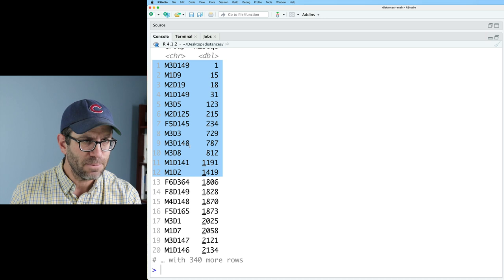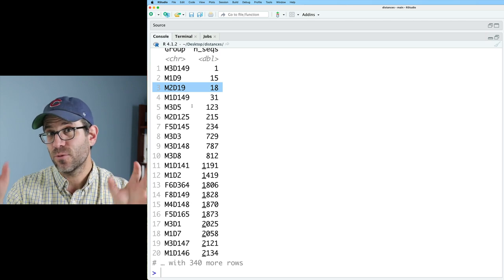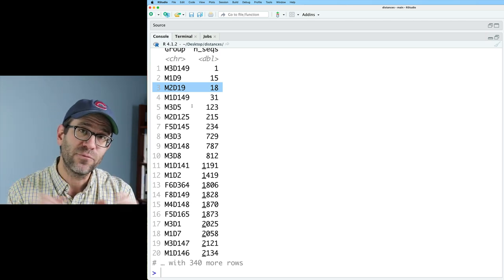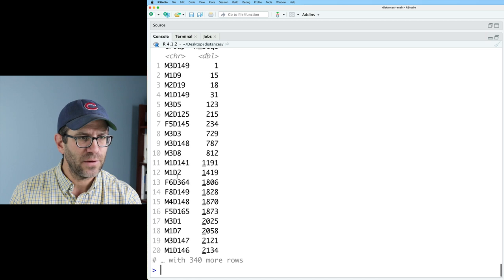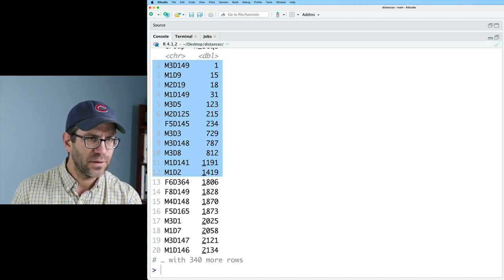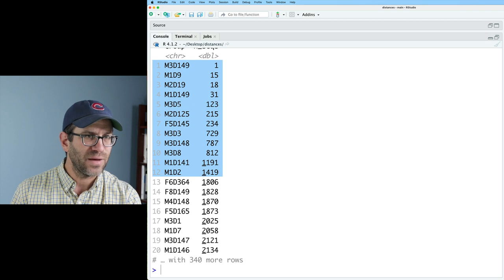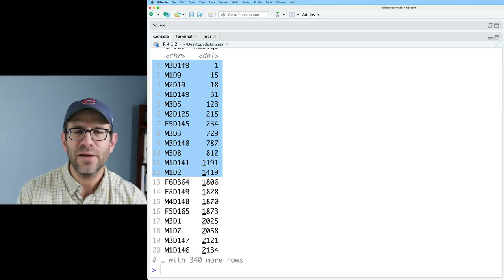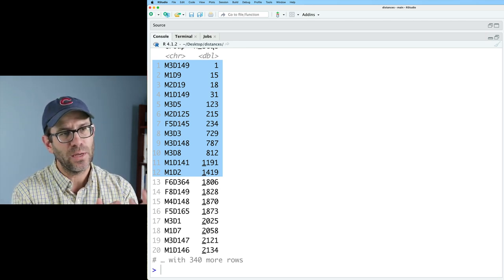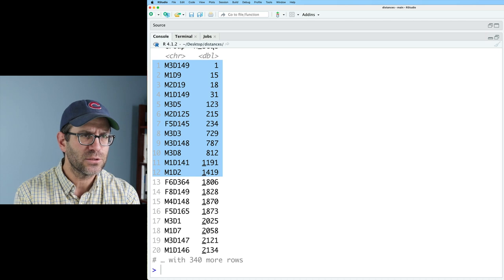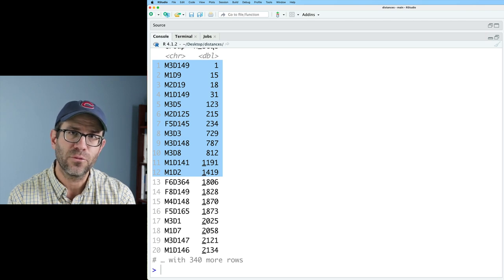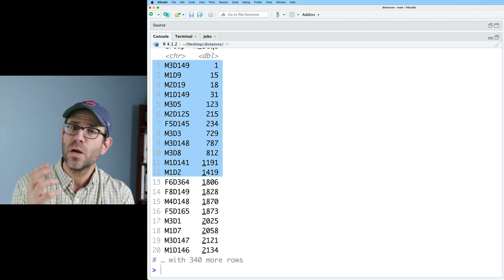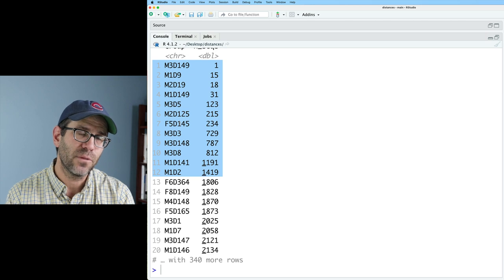And so again, there's 12 samples in here and it looks like there's maybe one, two points in here that aren't from those periods of concentration. So there's 10 points from the timeframe that I'm interested in. Now, the next thing I might say is, well, are these all coming from the same animal? And so again, if I look at these, I see that I've got three, four from male one, I've got one from male two, I've got five from male three, one from a female five. And so I'd kind of have to judge how problematic that is.